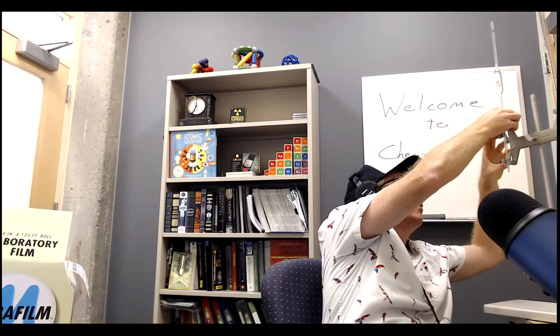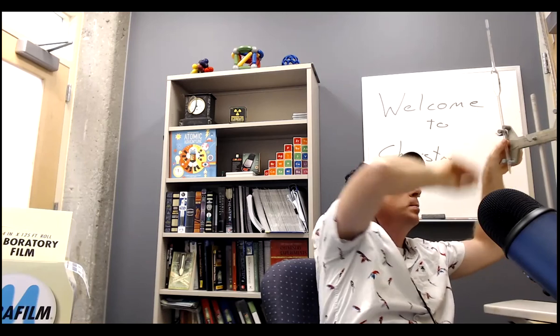Whenever you're not using this, these are round. They will roll off the bench, fall onto the floor, and break. Clamp it into your burette stand. Can you see my burette stand here? It doesn't really matter above or below, but this is just the safest place for a burette that's not in your hands. Sorry, a pipette. That's a pipette. This one's the burette.